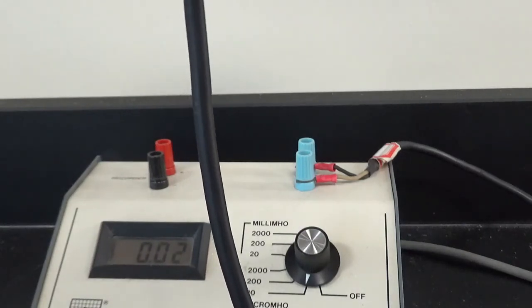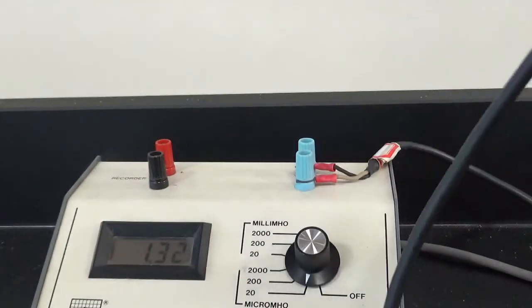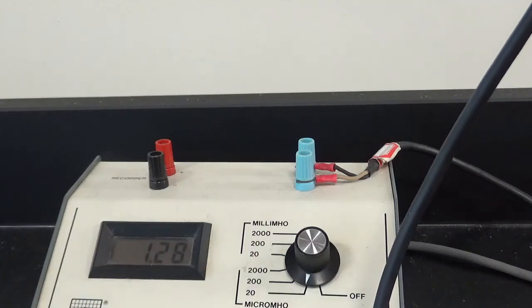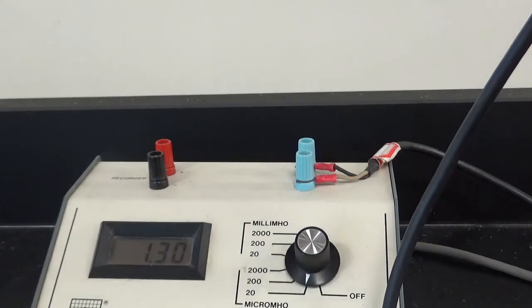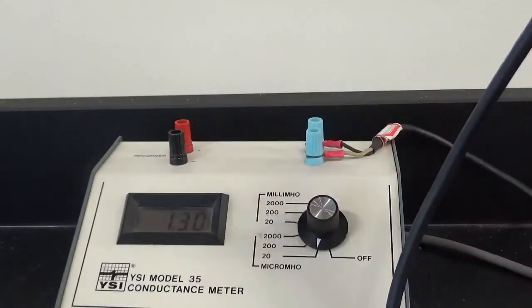When I started this whole rinsing process, and this cell hadn't been used for a while, I was up at 10. And with the first rinse, I was down to 3. And then you saw where I was at 1.5. So I think I'm good here. It seems to be stabilizing right there. Okay. So I guess I'll start with solution 1.